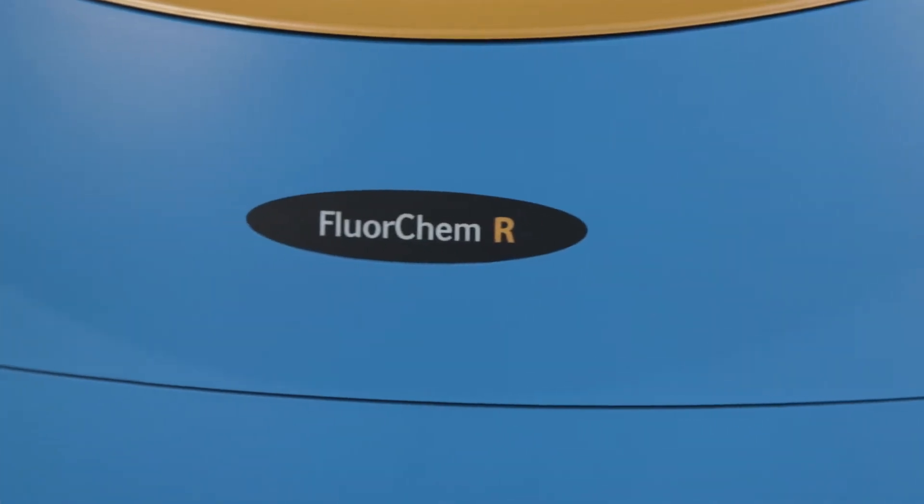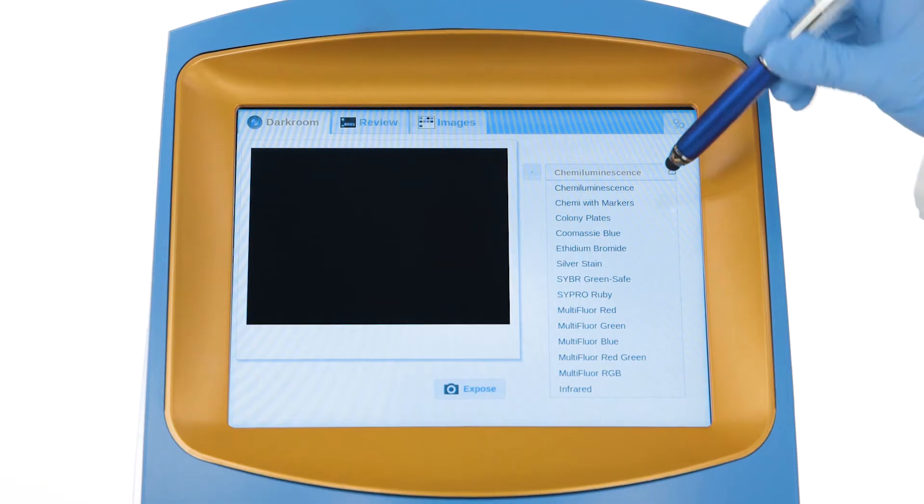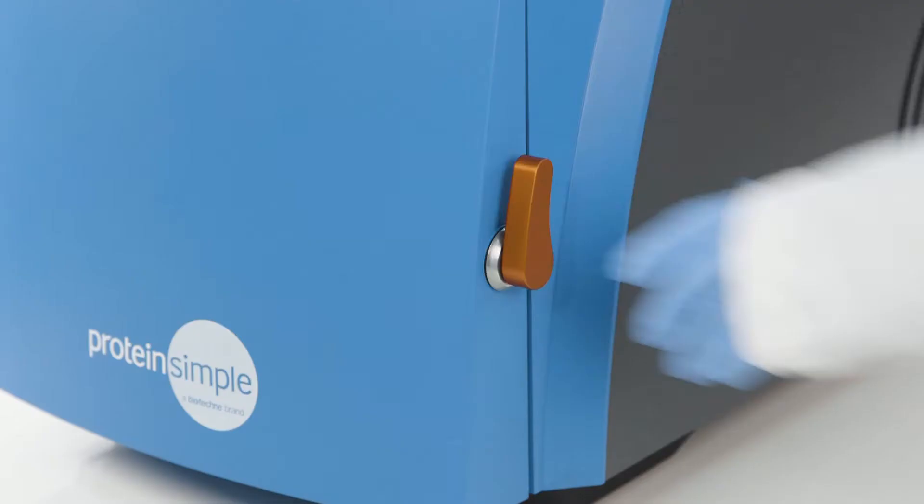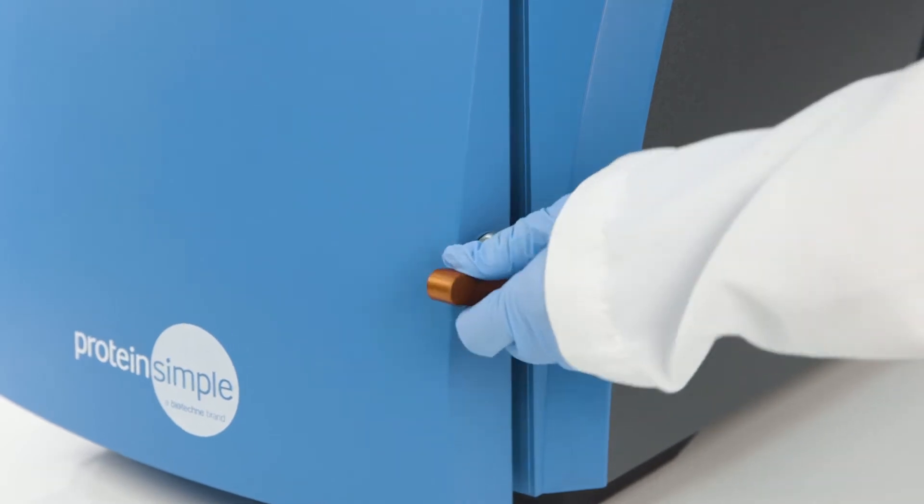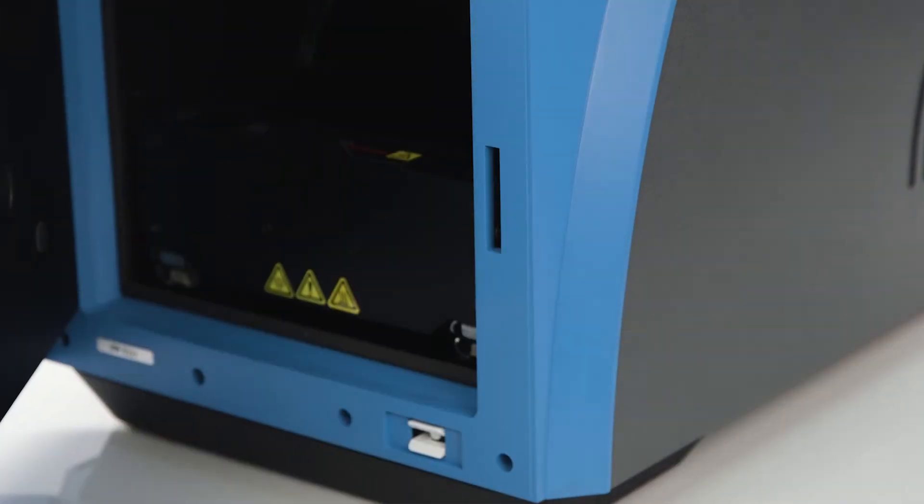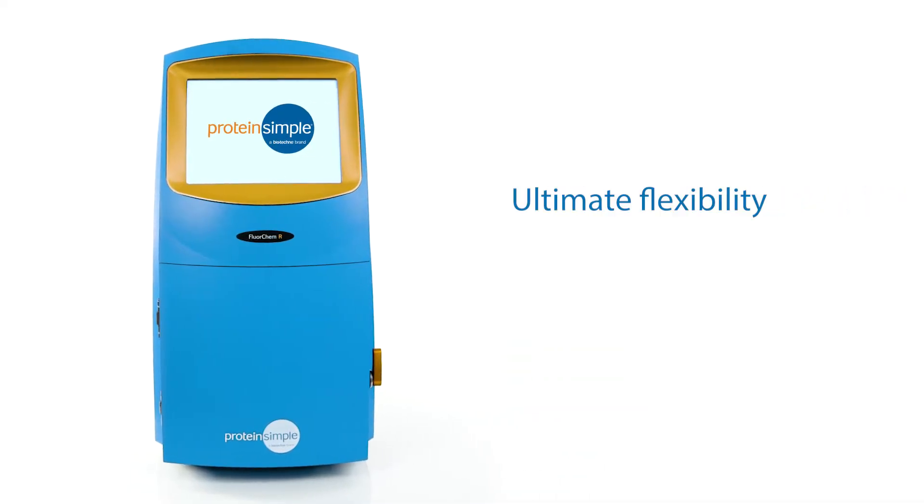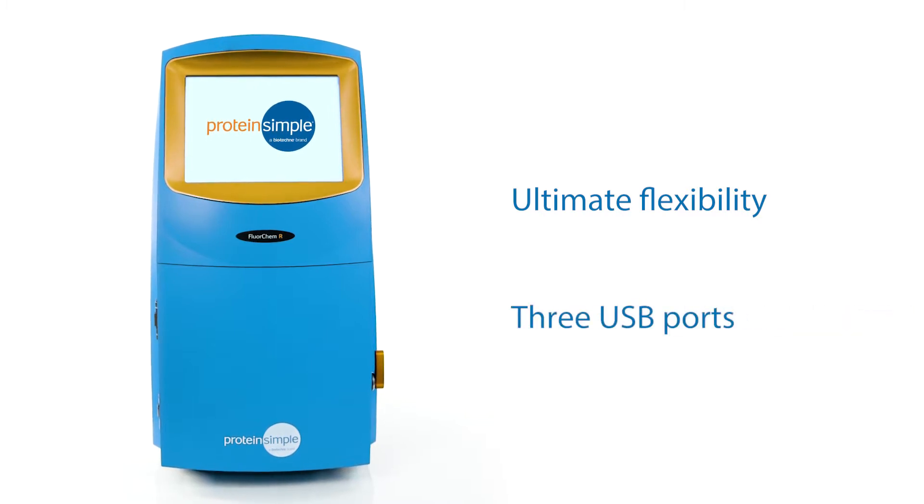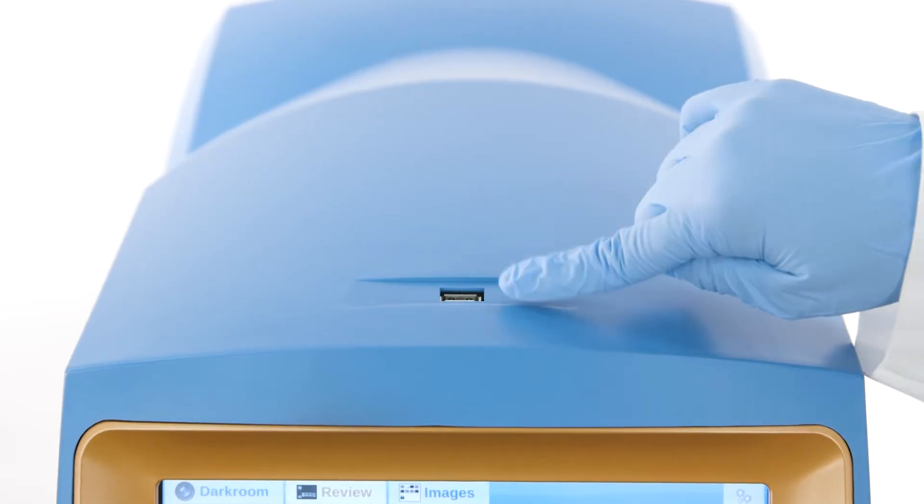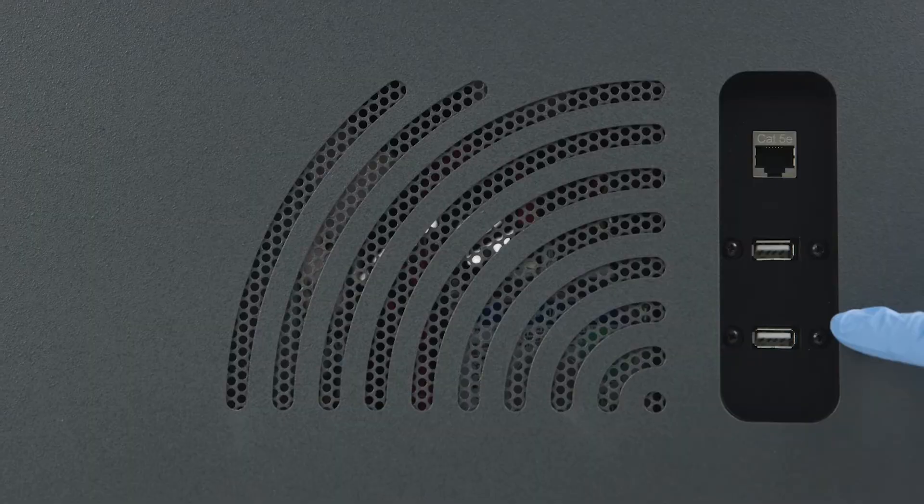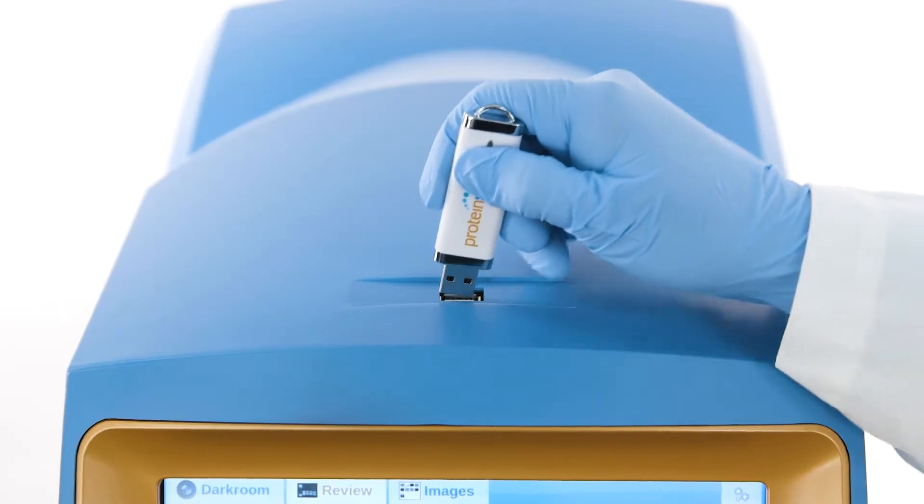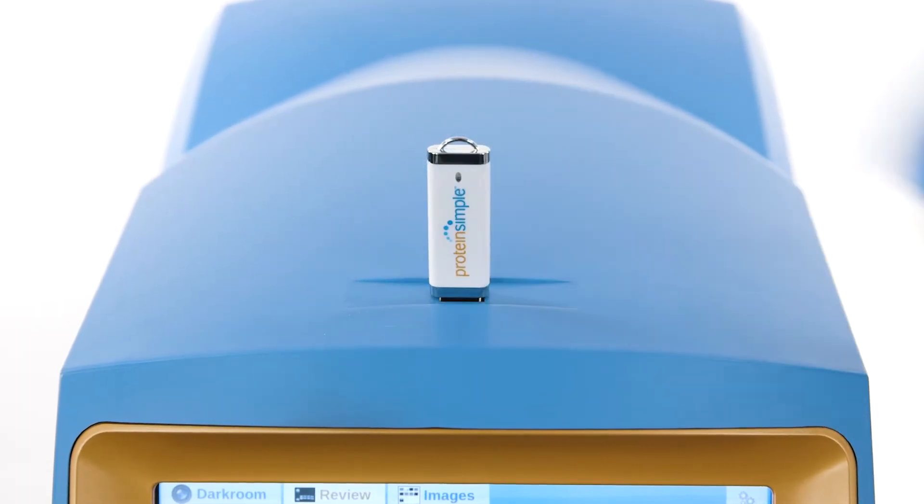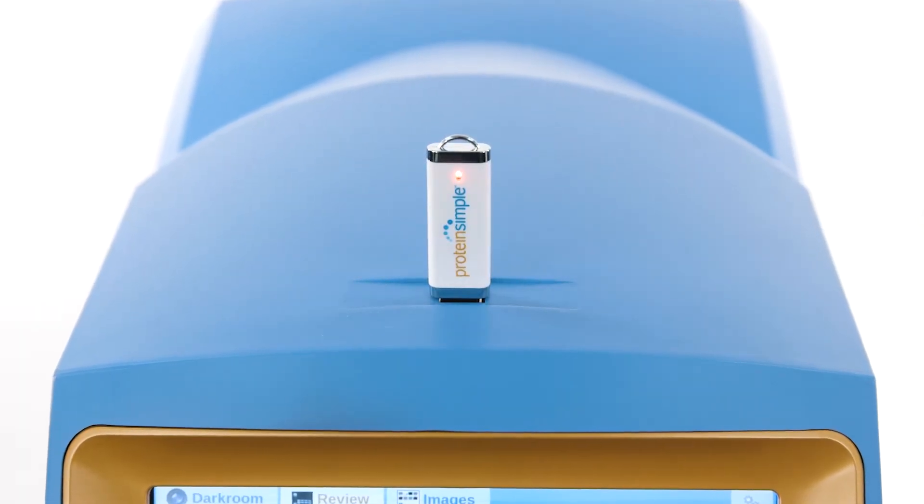FluorChem Imagers are user-friendly with a simple touchscreen interface and an easy-to-open door for loading samples. For ultimate flexibility, the systems include three USB ports—one at the top and two at the side—which are useful for saving images to flash drives or connecting peripherals like compatible printers.